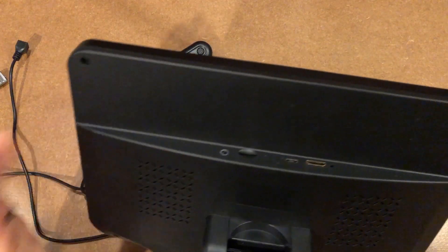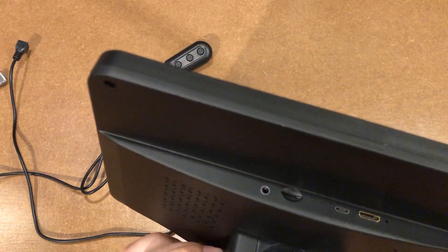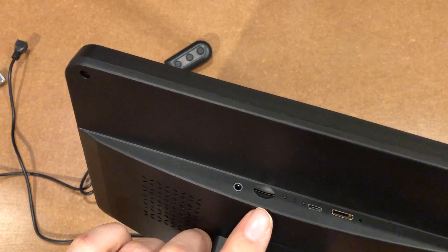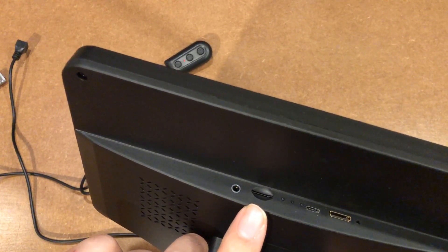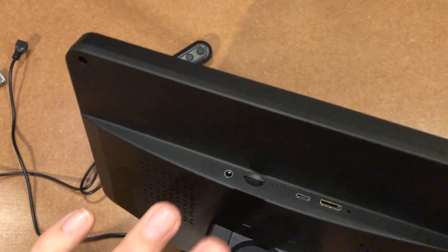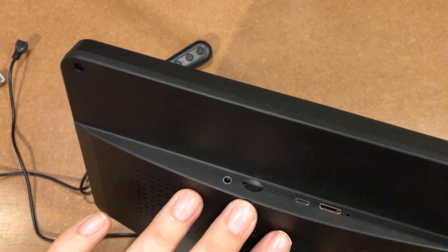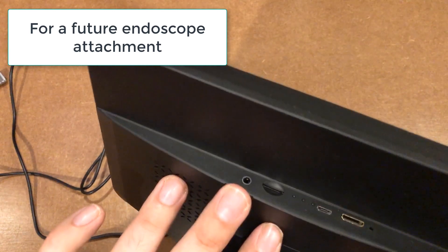The remote plugs right into the base, so you can use one cable to plug the whole thing in — that takes care of lighting, control, and power. You can also plug it straight from this into the computer if you want. It also has a micro SD slot, which I don't use that much, but if I did want to record sessions I can. The footage from this one comes out a lot less washed out than the other one — you'd expect to see what's on screen on the SD card, but in my experience the video from the other unit's SD card was way more washed out. And then we have this undocumented port here — I may try to find out what that is and will leave it in the comments if I do.